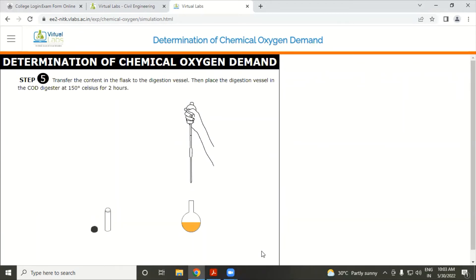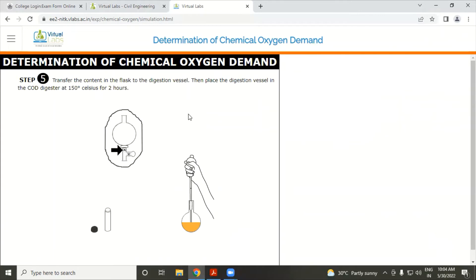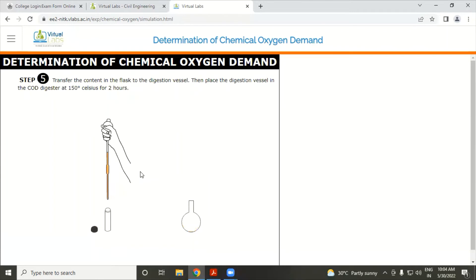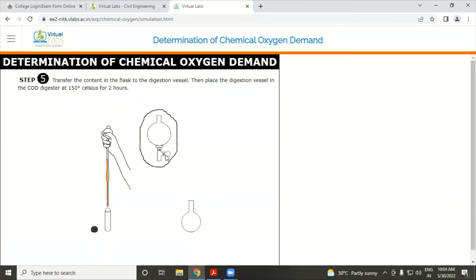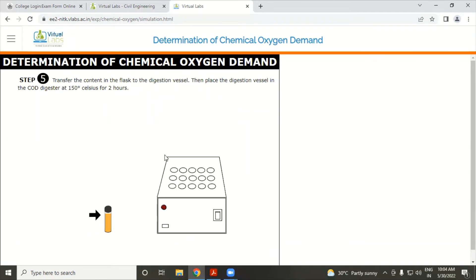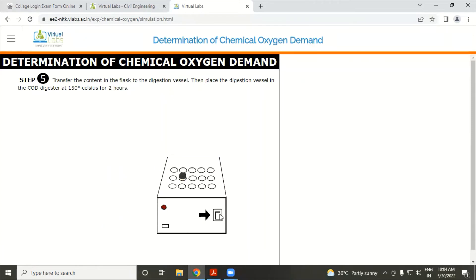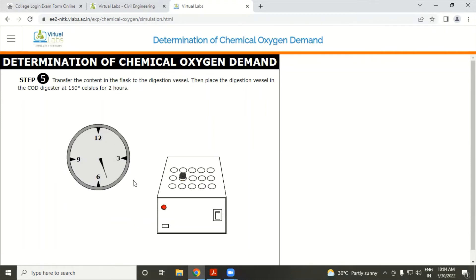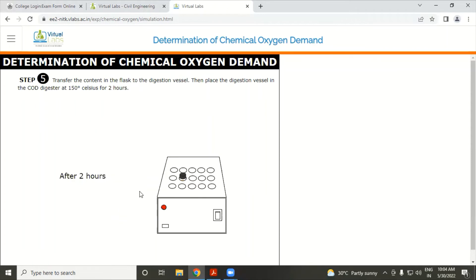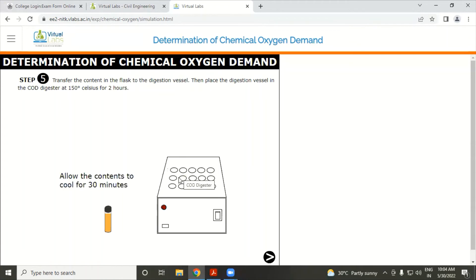Transfer the contents of the flask to the digestion vessel and place it in the COD digester at a temperature of 150°C for 2 hours. After 2 hours, remove the bottle and cool for 30 minutes.